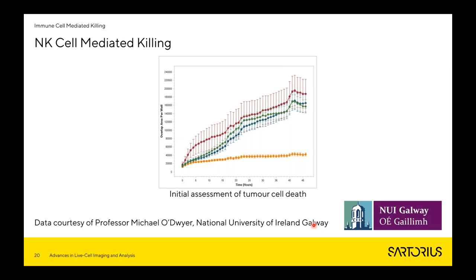specifically target cell death. However, when we looked at the initial overlap analysis, we didn't see much in the way of genuine signal. The red, blue and green correspond to 3 different effector to target ratios. In fact, the green was the highest effector to target ratio. So initially we were a little disappointed that this assay didn't yield any difference.